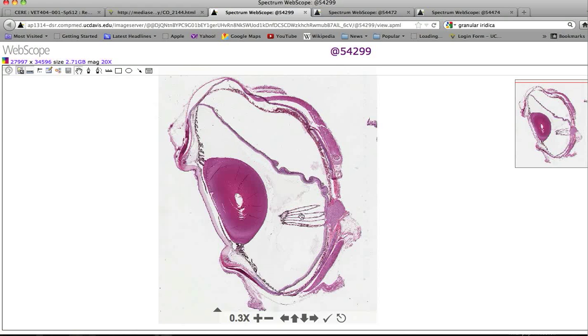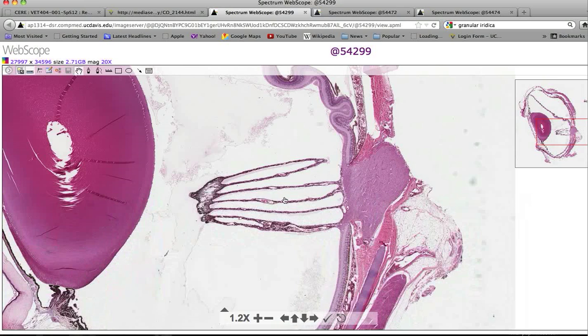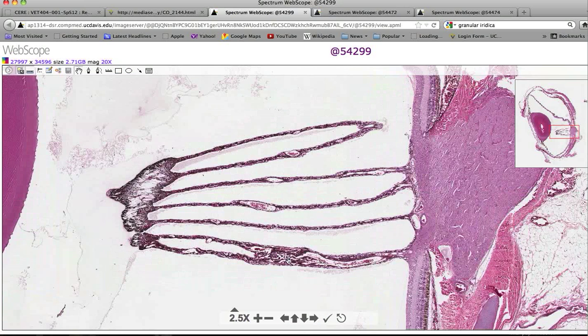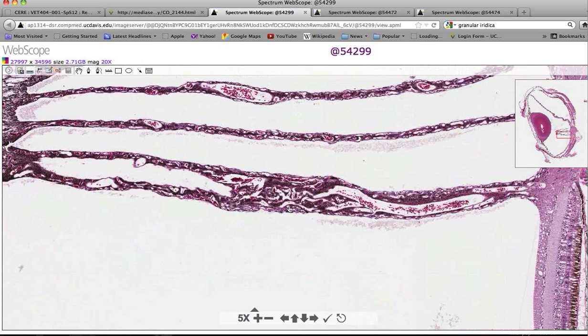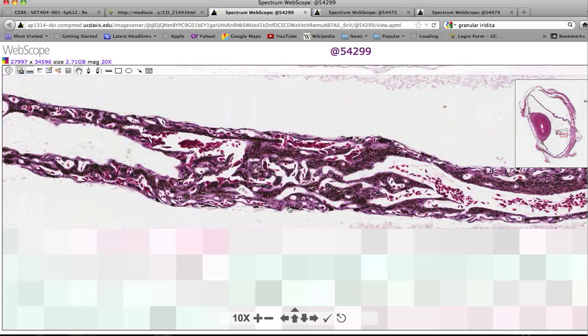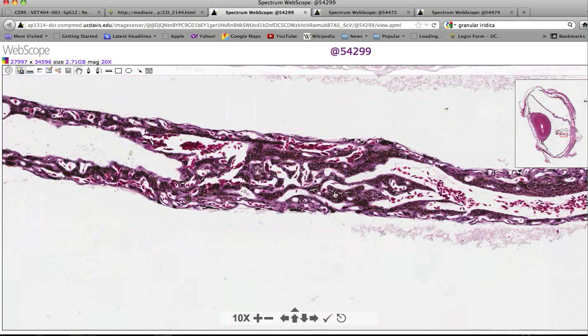This structure will oscillate and help circulate things around. Looking at higher magnification, we can see it is very similar to choroid—pigmented melanocytes and lots of blood vessels.